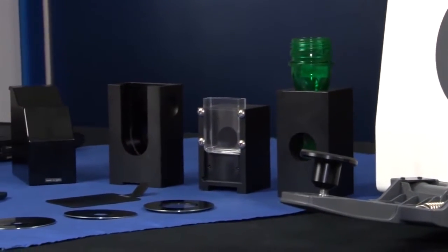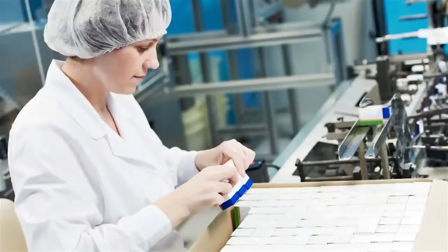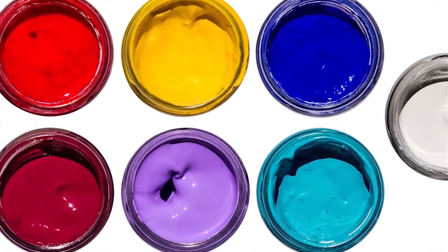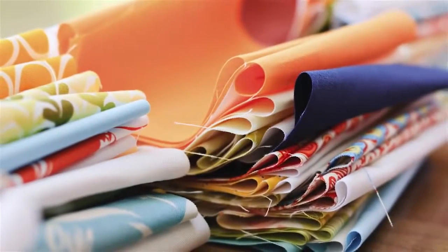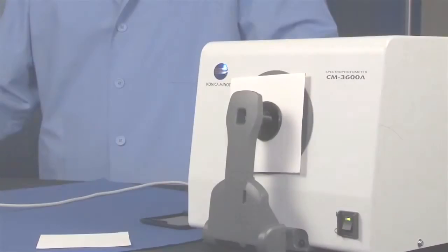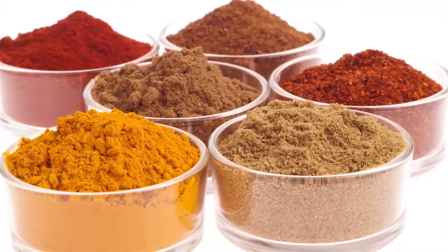This versatile spectrophotometer is popular within laboratory and manufacturing environments for evaluating the appearance of samples small to large in size, including plastics, textiles, paper, liquids, and fine particles.